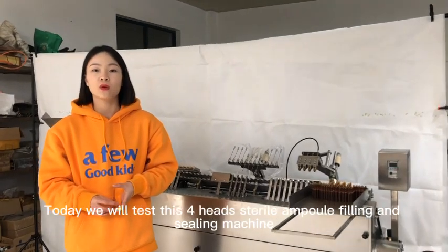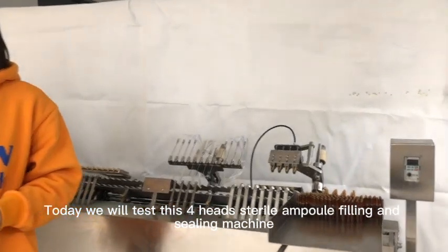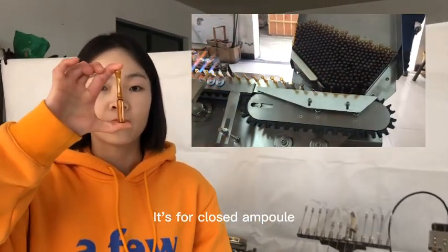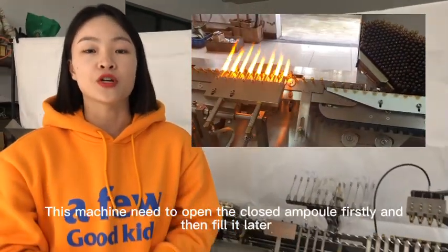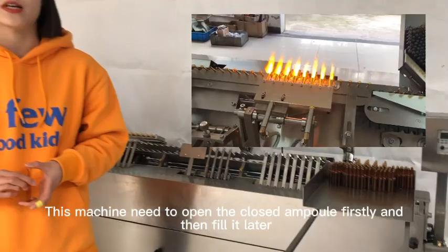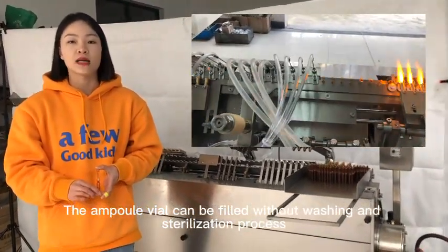Hello everyone, today we will test this pre-filled sterilized ampoule filling and sealing machine. It's for closed ampoules. This machine needs to open the closed ampoule firstly and then fill it. The ampoule vials need to be filled without washing and sterilization.